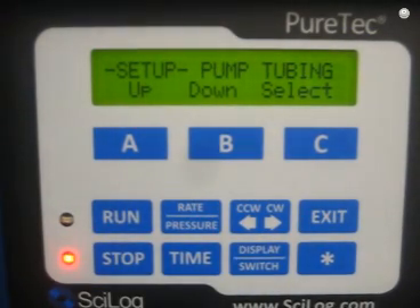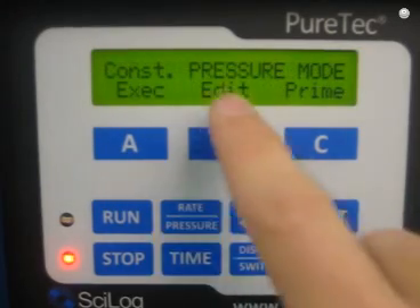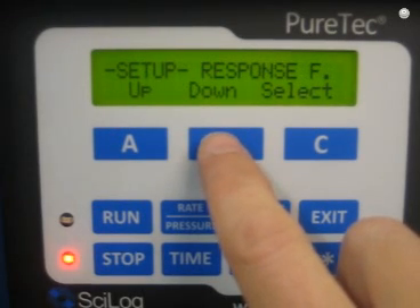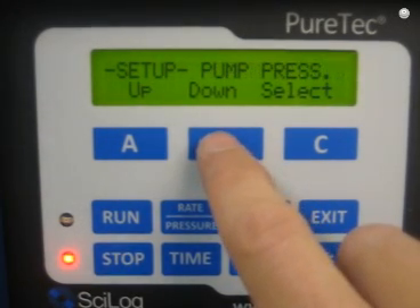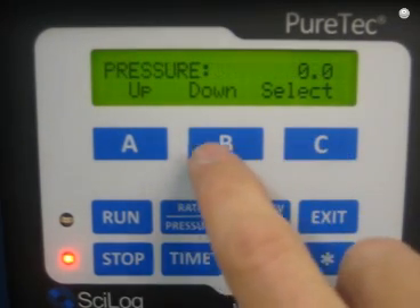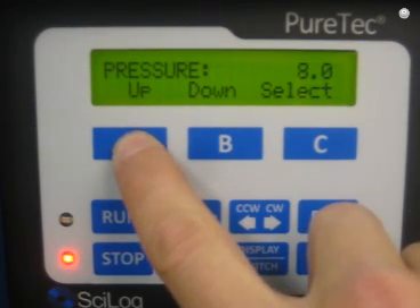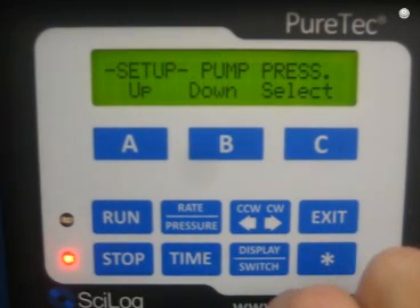Another very important setting for a constant pressure TFF run is obviously going to be the pressure. In constant pressure mode, I go to Edit and down through the menus. There's response factor, clear cumulative, a menu to zero the pressure sensors, alarm enable, alarm limits, and then here's pump PRESS — that's pump pressure. I'm going to hit Select and change it to 20 psi. Then I hit Select and there we have our TMP value. Very simple.